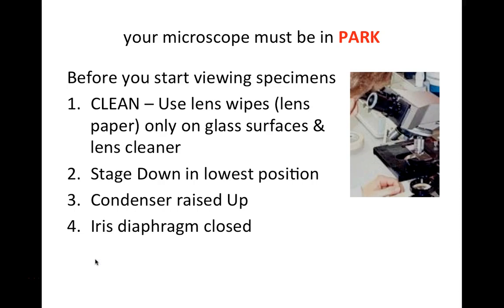Before we get started, we need to make certain our microscopes are in park. This means the microscope needs to be clean before you start. Make certain that the non-glass surfaces have been wiped clean of any dirt or oil, and the glass surfaces — the magnifying lenses — make certain those are clean also, but only use lens wipes, which I commonly call lens paper. This is specifically designed for the glass surfaces on the microscope.